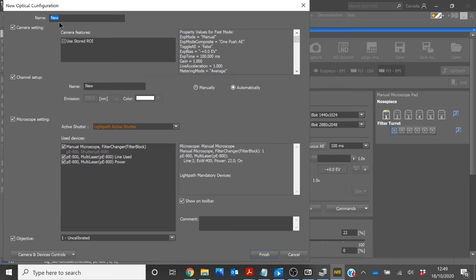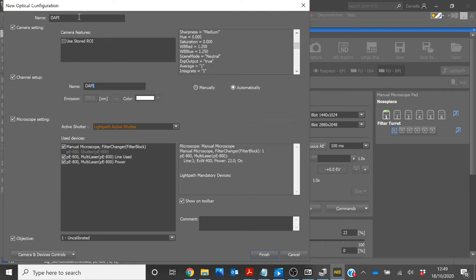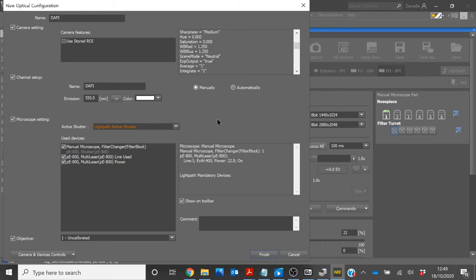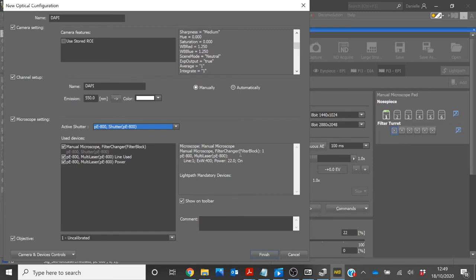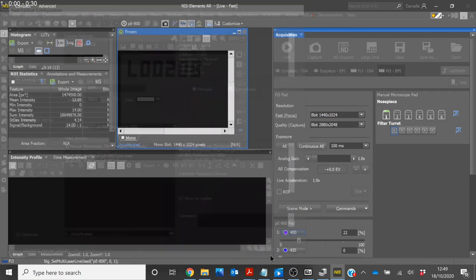First of all, you will need to name your optical configuration. We will be using these camera settings automatically applied. The channel setup name will update in line with what you have typed in the initial name box. And if you wish, you can adjust the emission and the color manually. Set the active shutter to PE800. And you will see here that the excitation wavelength and power is set as you previously defined on the 800 pad. Once you are happy with everything, you can then select Finish.